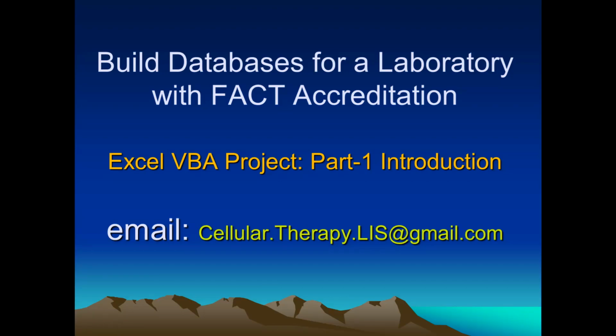Hi, I'd like to make a series of videos to share my experience building databases for cellular therapy labs. So today will be part one, introduction.